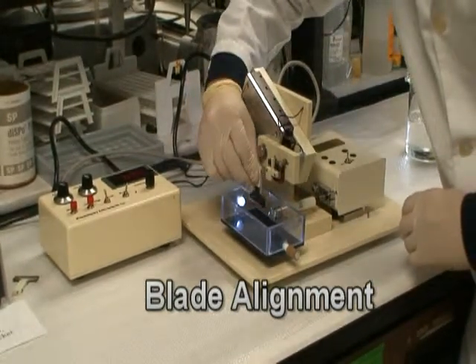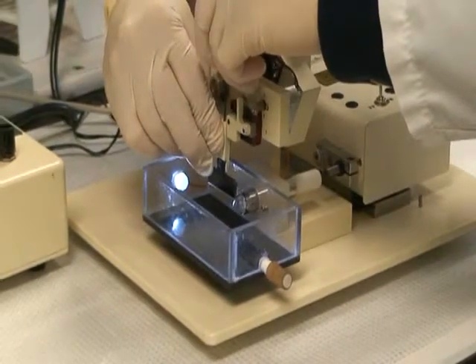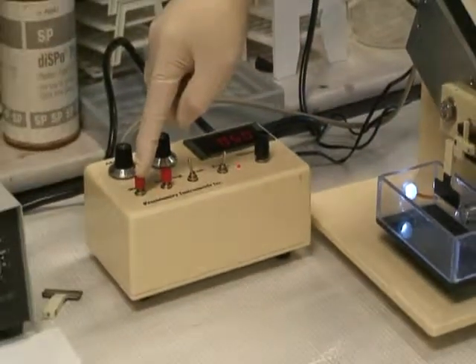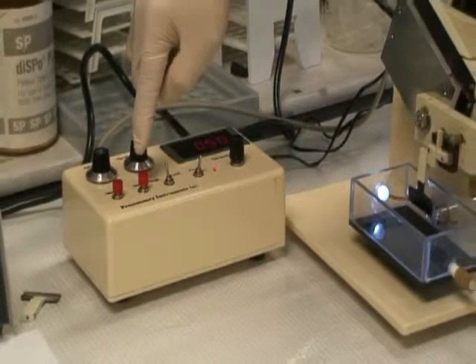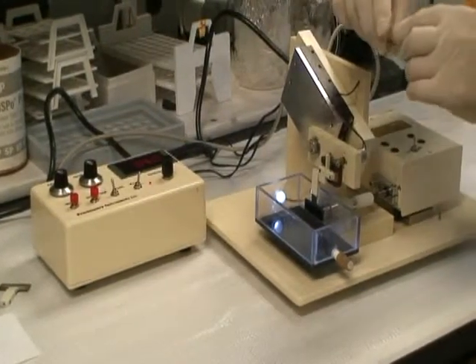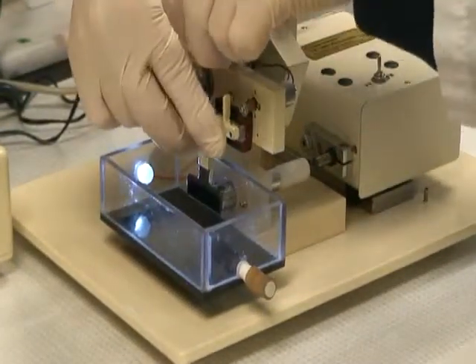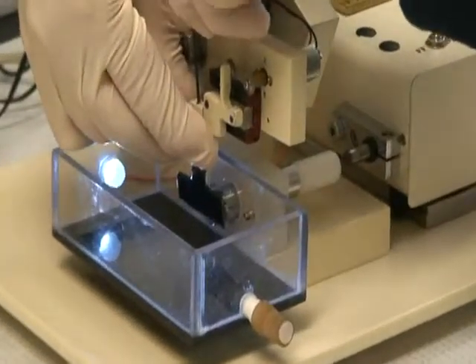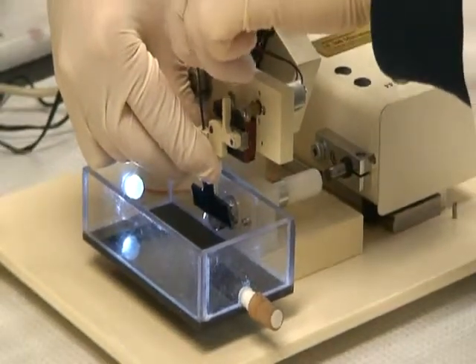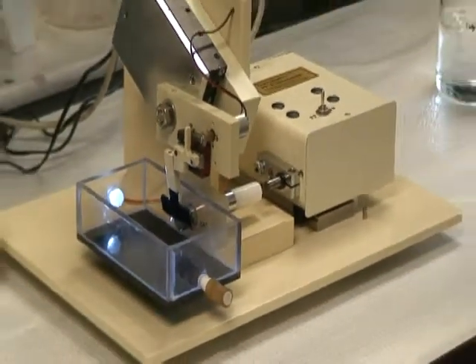Put the blade holder back onto the machine. Press the start button. Press the stop button. Tilt the blade holder toward the specimen syringe and leave a small gap between them. Tilt the blade.